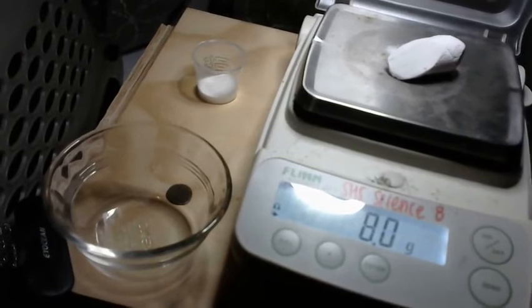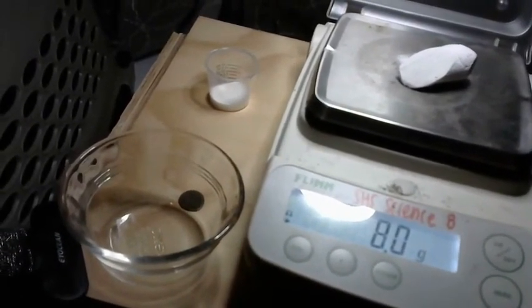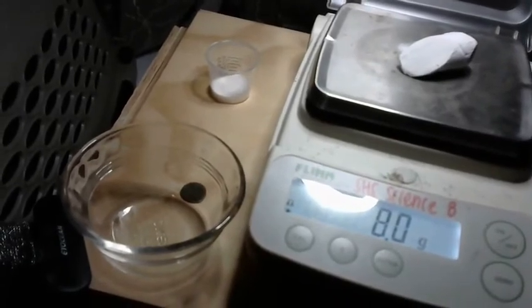Or there's another way to do this. What you could do is find the mass before. So the mass before is 8.0 grams. And I'm going to go and write my name and then come back and find the mass afterwards.